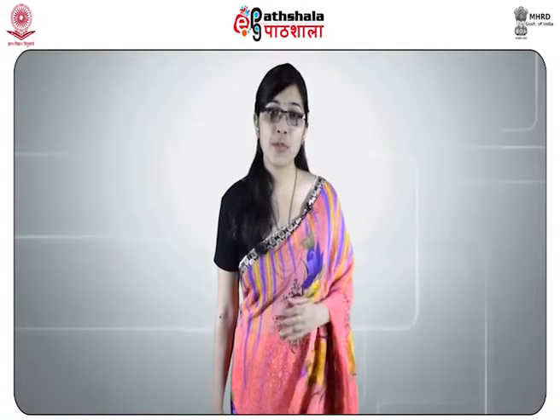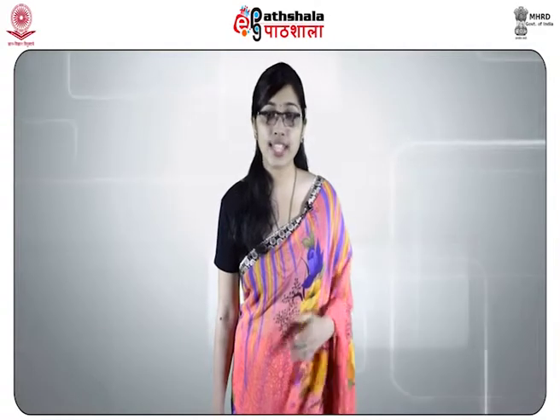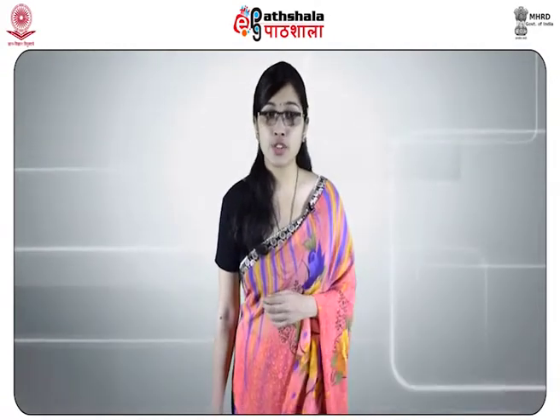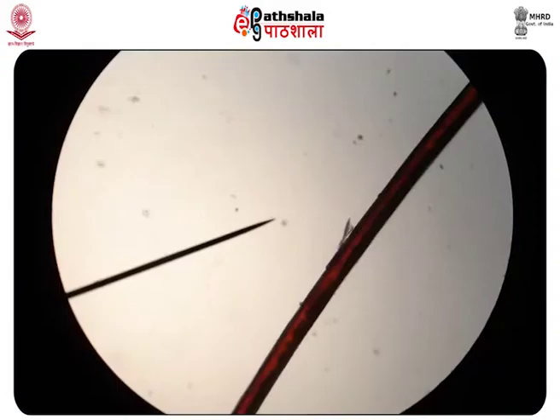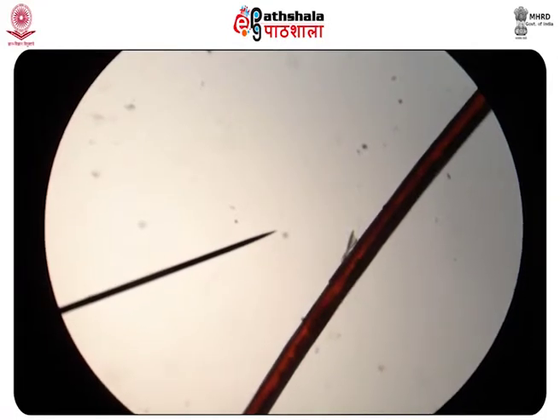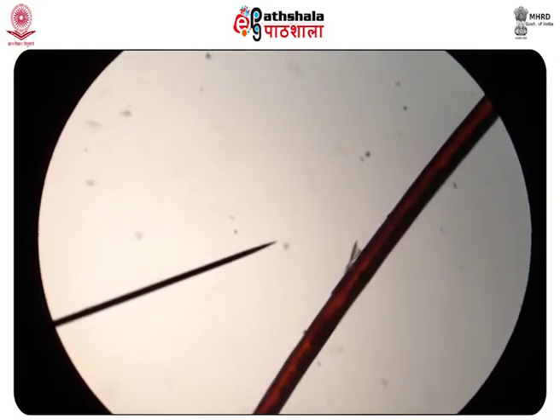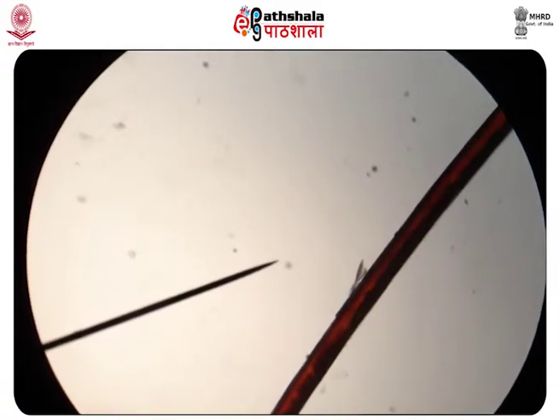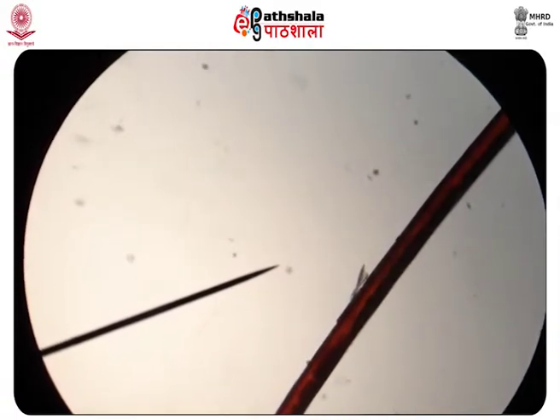The various types of microscopes that are used for the examination of hair are: first, the stereoscopic microscope. For initial examination of mounted or unmounted hairs, stereoscopic microscopes are used with a magnification range of up to 100x.